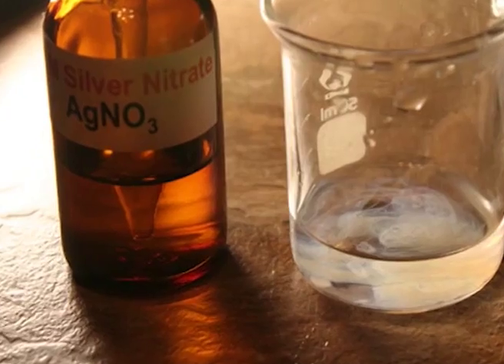Next students, we will be discussing over here the mechanism of silver nitrate technique, because in this lecture we have two chemical techniques, that is, one is the silver nitrate and the other one is the iodine fuming method. So, first we are taking up the mechanism of silver nitrate technique.